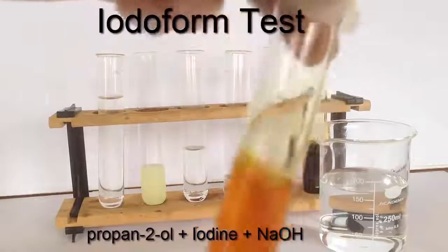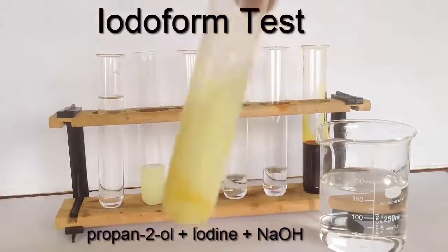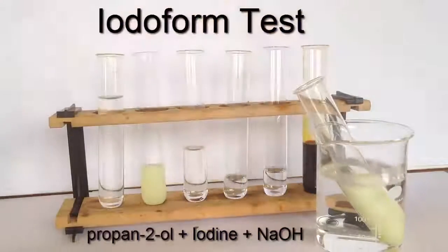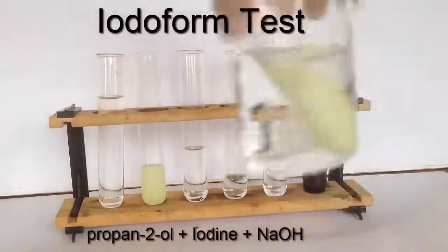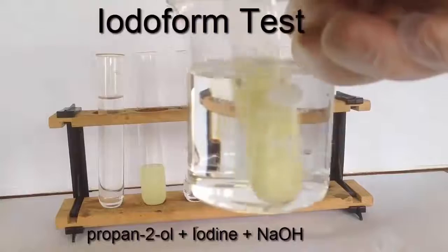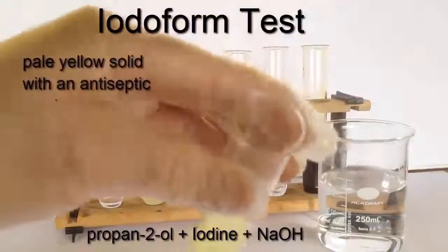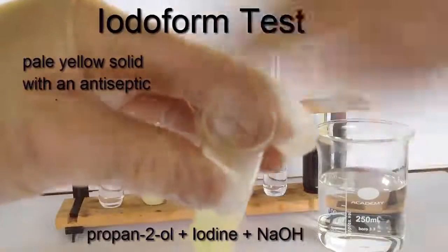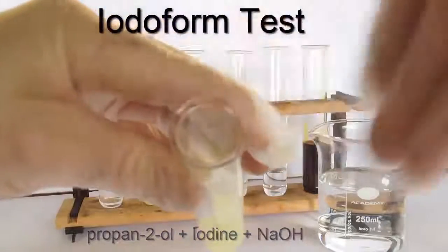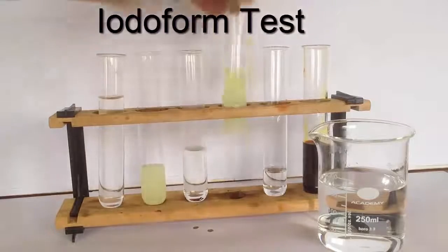The brown color is fading, and we're looking for again one of two possible outcomes. And you can see already there that it's jumped over to that yellow color, yellow and cloudy, because we formed triiodomethane, known as iodoform. Pale yellow precipitate. I'm wafting the fumes towards my nose there, picking up the antiseptic smell.